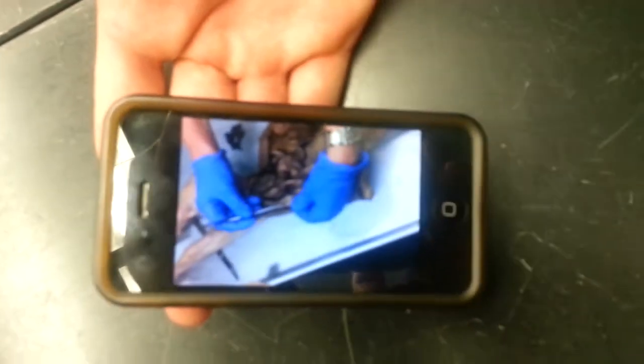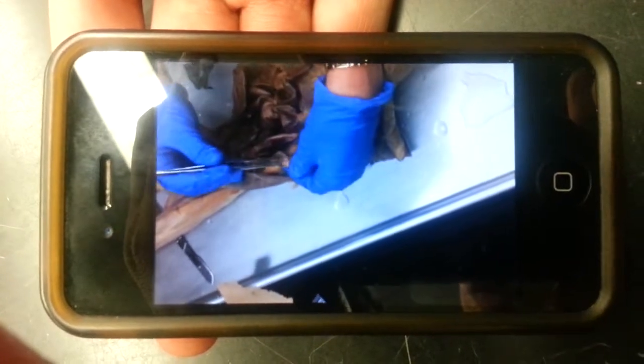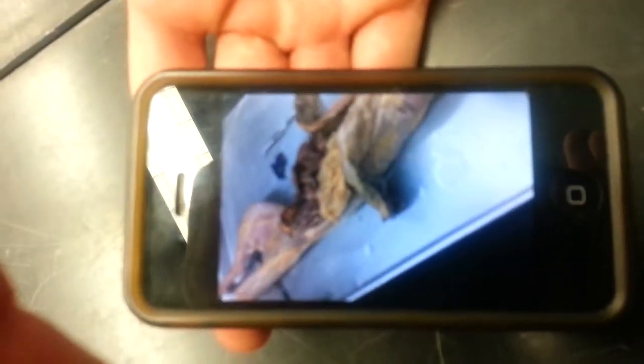That little pea shape. Yeah, it is. But you might be able to see at the end of this, there are these little finger-shaped projections. These are the fimbriae. It kind of comes up and funnels out, and then these little fimbriae surround. So if this is the ovary, the fimbriae kind of do that. They do the same thing in the human. The ovary's here, and when it ovulates the oocyte, the fimbriae pick up the oocyte and bring it into the fallopian tube.